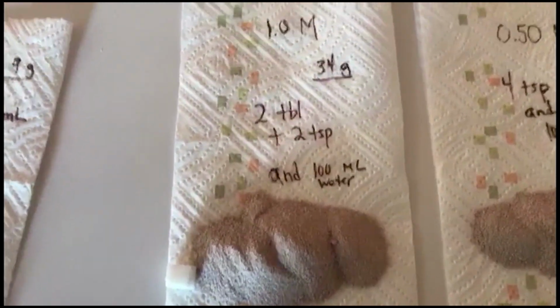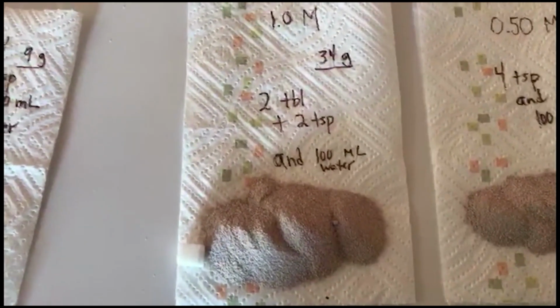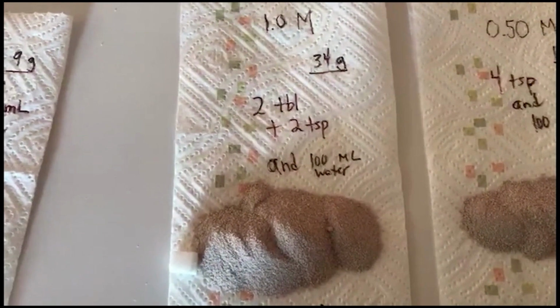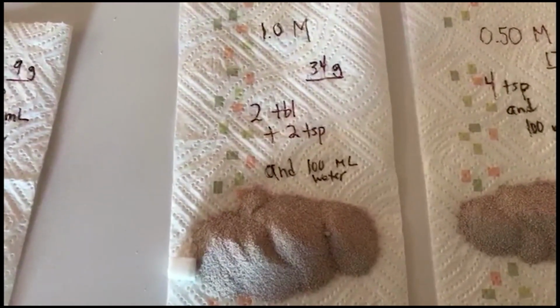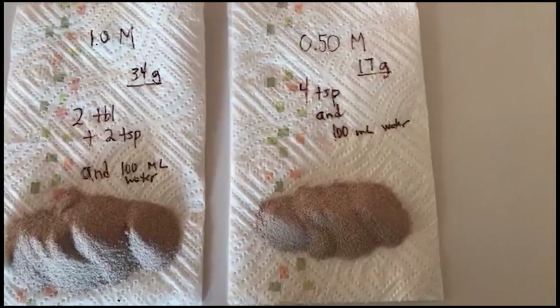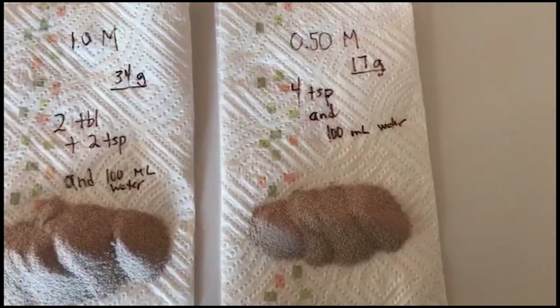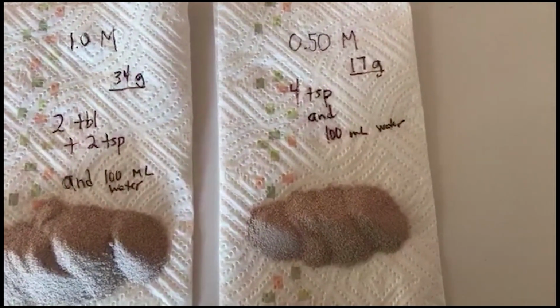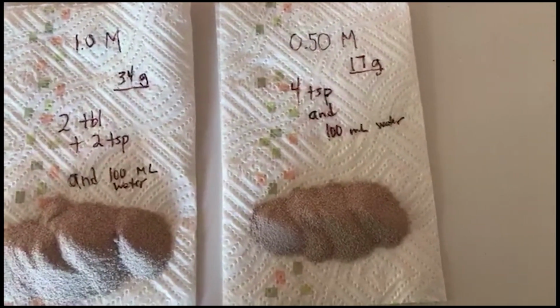Then we're going to mix up a 1 molar solution. And now you notice that's a lot more powder, and we're going to end up with about 34 grams based on our calculations from the pre-lab, once again in 100 milliliters of water. And then the 0.5 molar is half of that, and that's going to be approximately 17 grams, so I measured that out, and we add that to 100 ml of water.